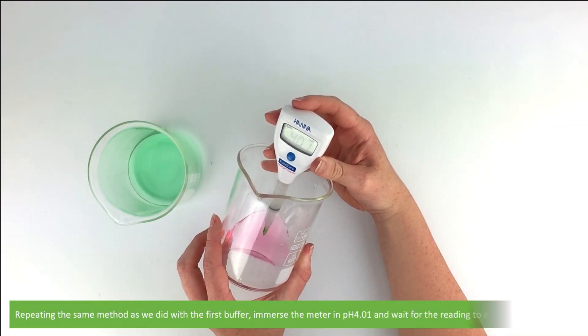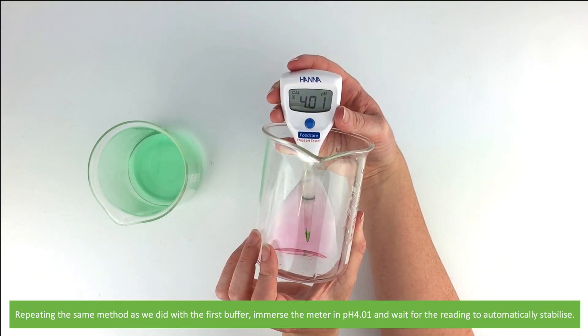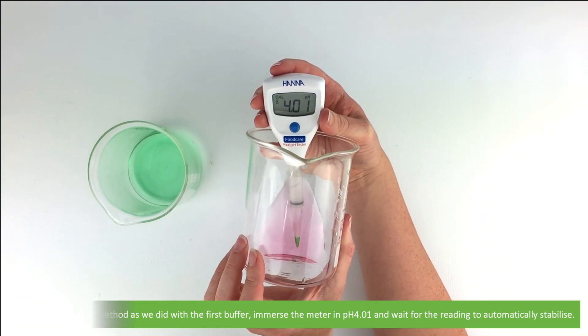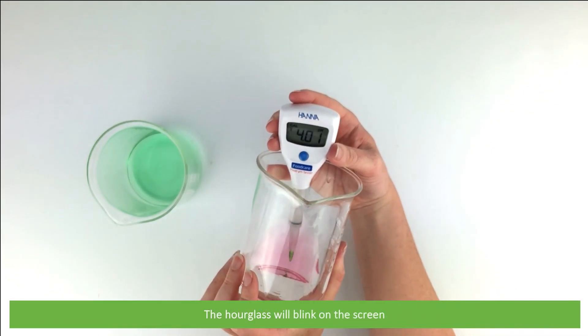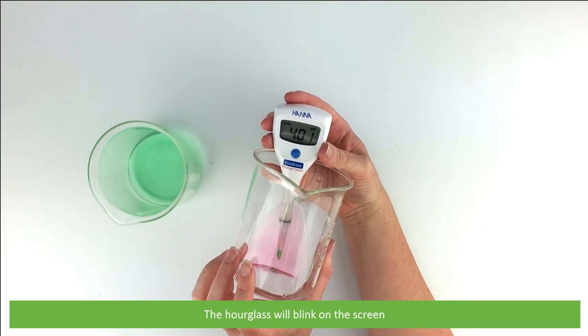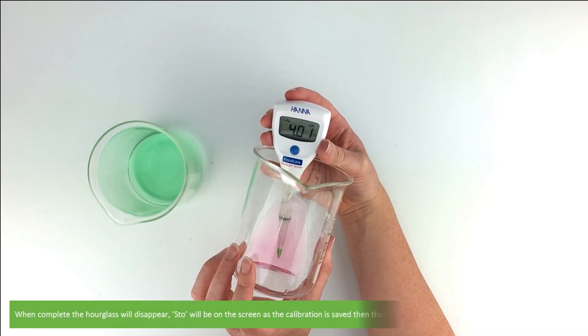Repeating the same method as we did for the first buffer, immerse the meter in PH4.01 and wait for the reading to automatically stabilise. The hourglass will blink on the screen. Once complete, the hourglass will disappear.